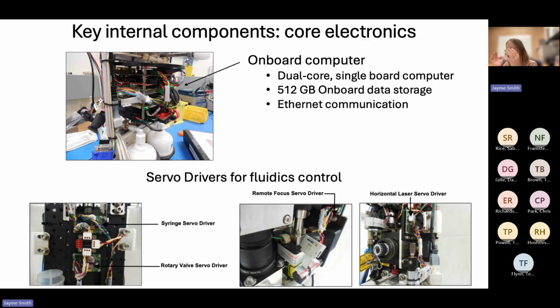If you're not connected to the internet, you can set it to run, and if you wanted to talk to it without taking the housing off, there's an assembly on the top that you can connect to. And then it has several motors here to control the syringe and all of those different abilities to make fine-tuned adjustments from a remote location.